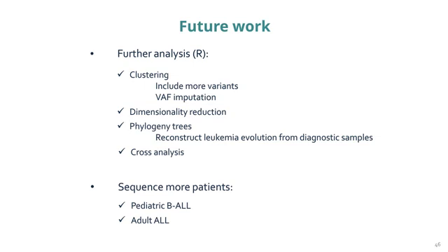We have a lot of ongoing work sequencing more patients. We also collected BLL and other samples, whose clonal architectures I didn't show today, but we are also building reference maps and diagnoses for all these groups. And then, of course, we have to integrate and include all the RNA sequencing part, which I didn't talk about today, but that data that we have for each of the samples.